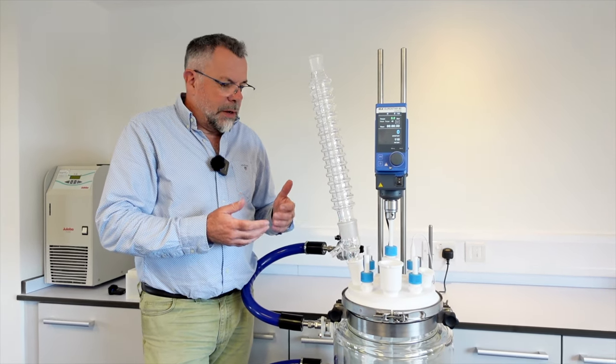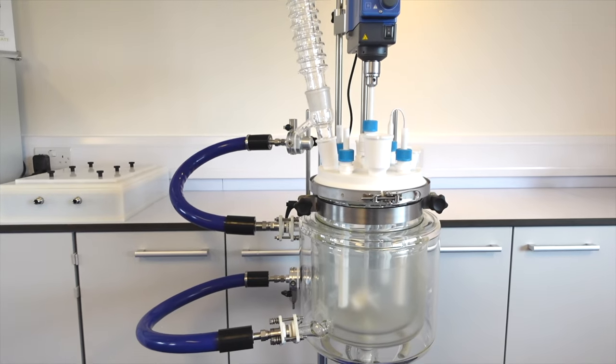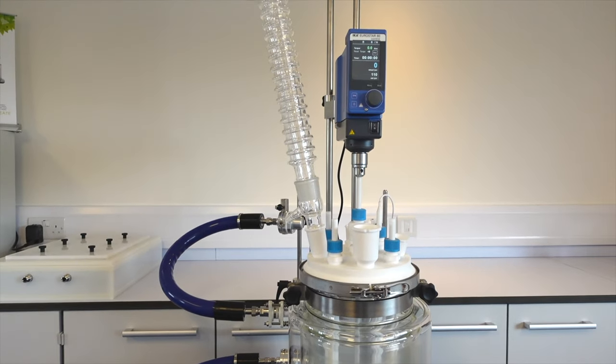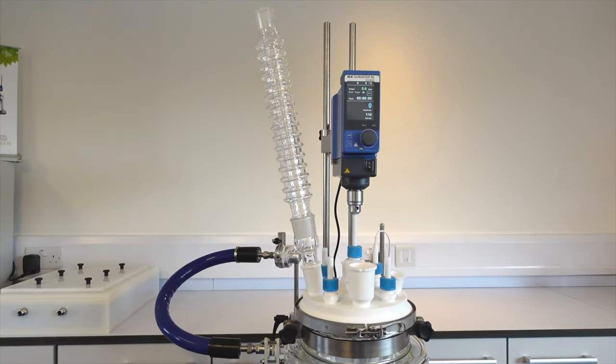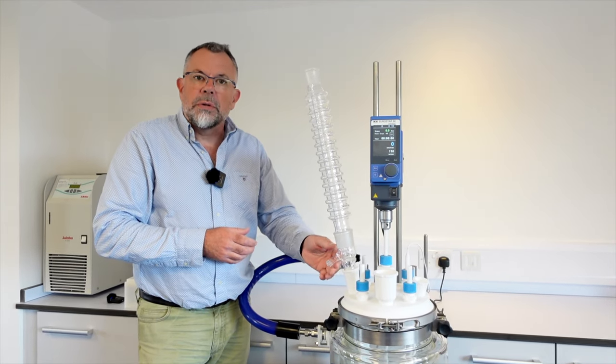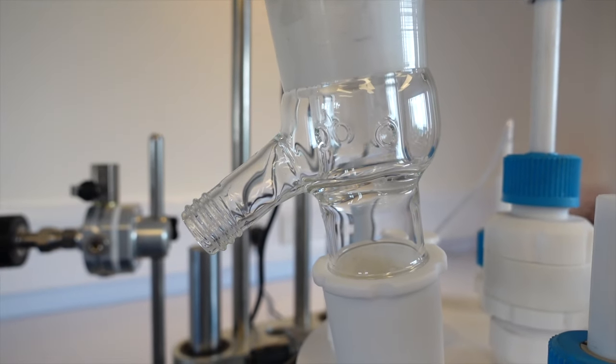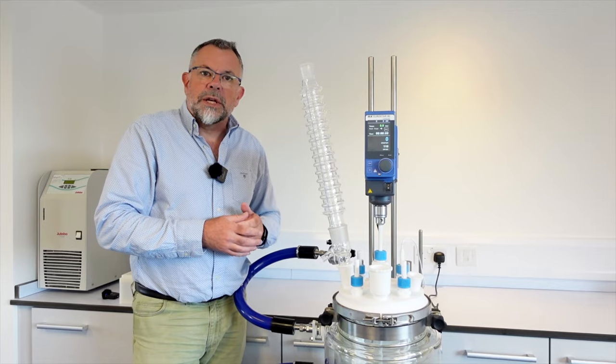Here we have an atom reactor stand with a five liter vessel, and this particular version of the Condensing Maxi has the option for performing distillation — hence the side arm here. There are a few other options we'll explain in a future video.